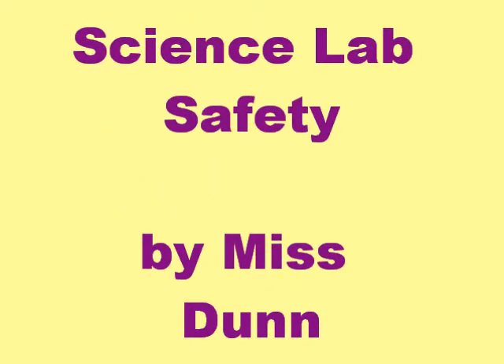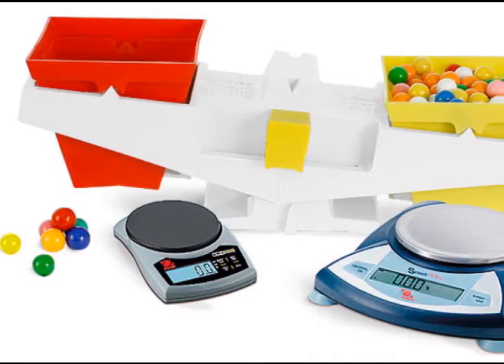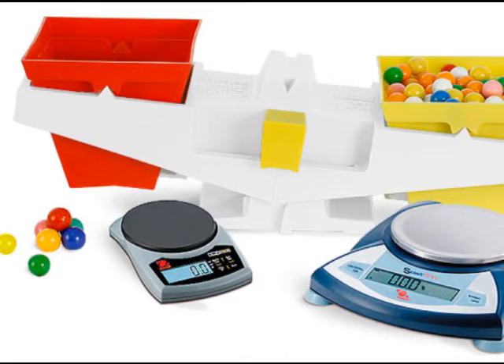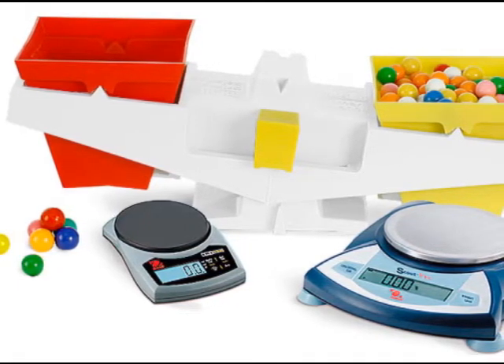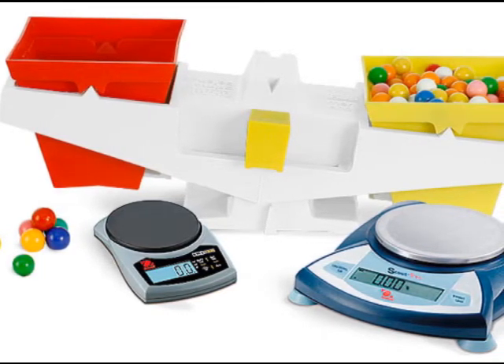Welcome to Ms. Dunn's science safety video. Today we're going to learn about several things, but the first thing we're going to learn about are scales and using balances and scales in a science project.